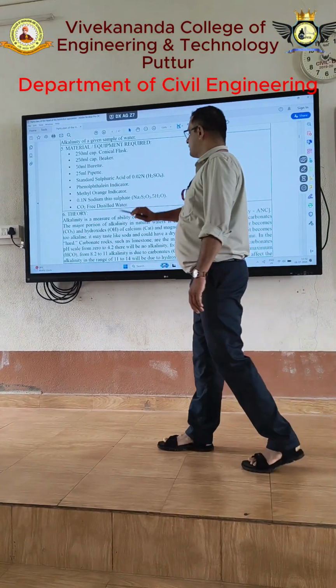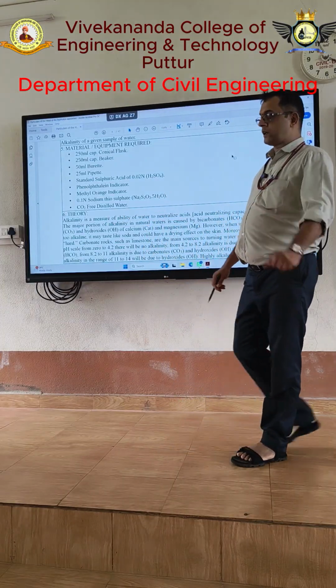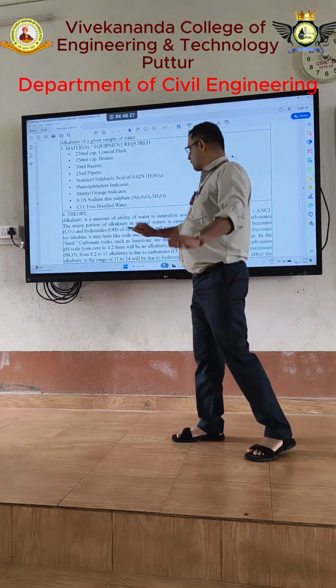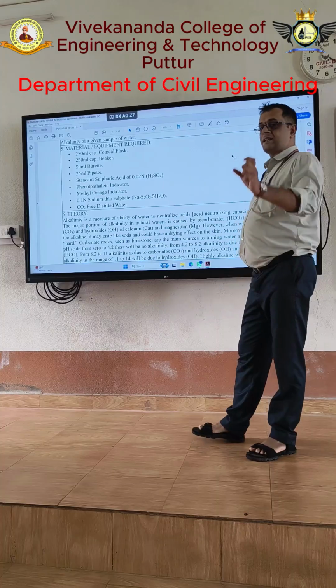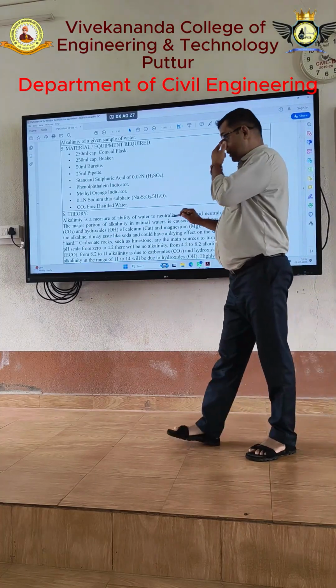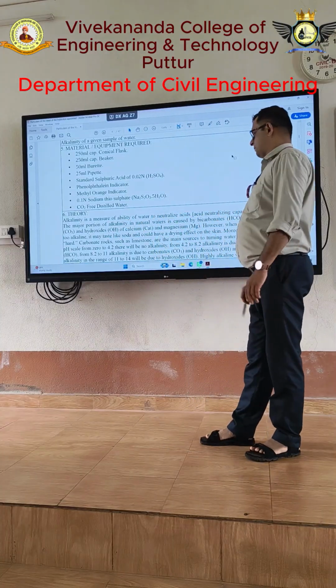Next, the theory part. Alkalinity is a measure of the ability of the water to neutralize acids. The major portion of the alkalinity in natural water is caused by bicarbonates, carbonates, hydroxides, then calcium and magnesium.